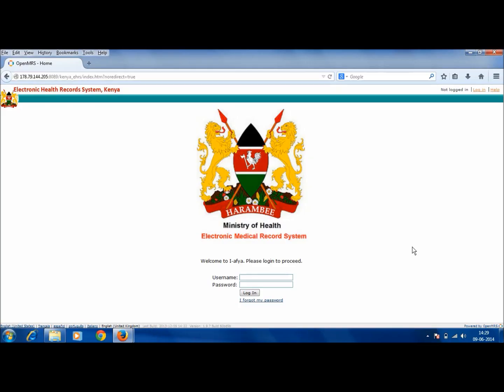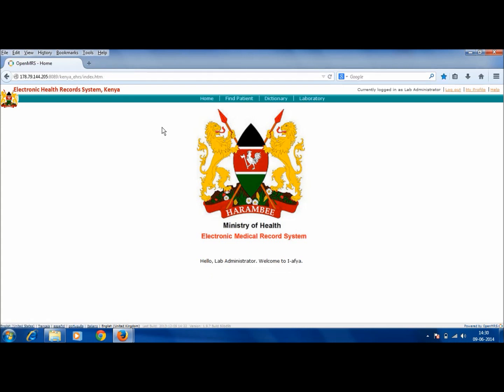Hello everyone. Now let us see the working of the lab module. To do so, type in the URL and login through a lab administrator's username and password. On successful login, the following screen will appear. Click on Laboratory on the navigation menu.